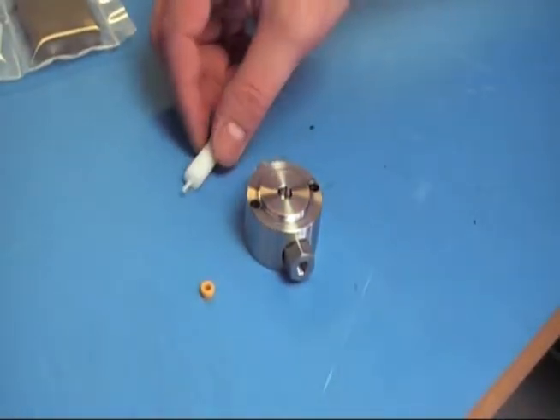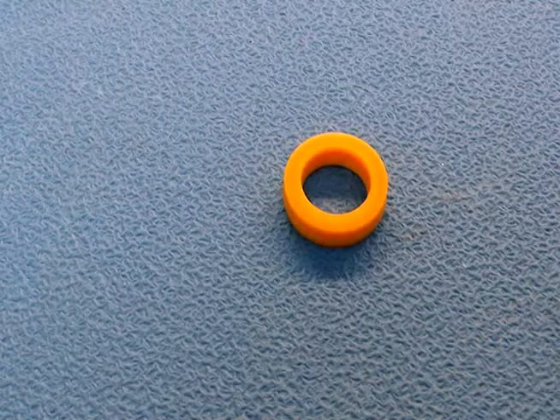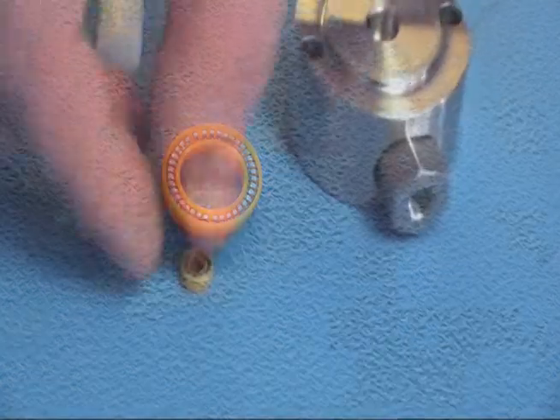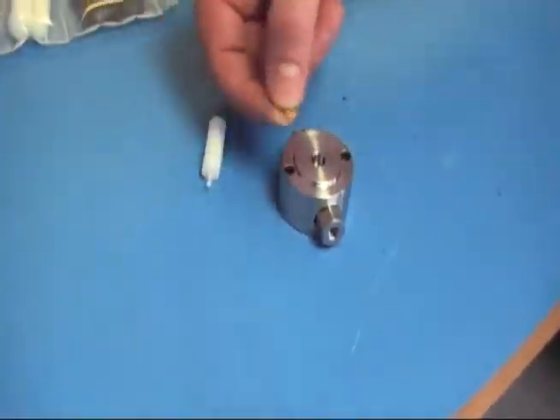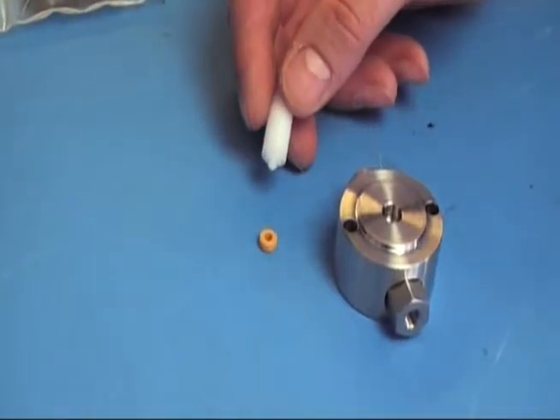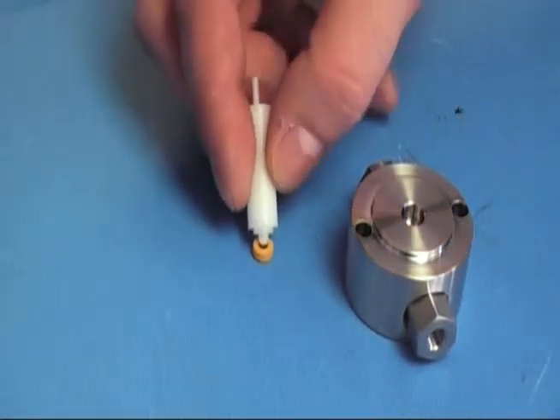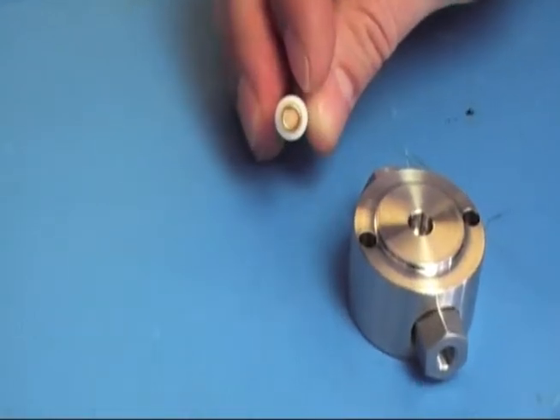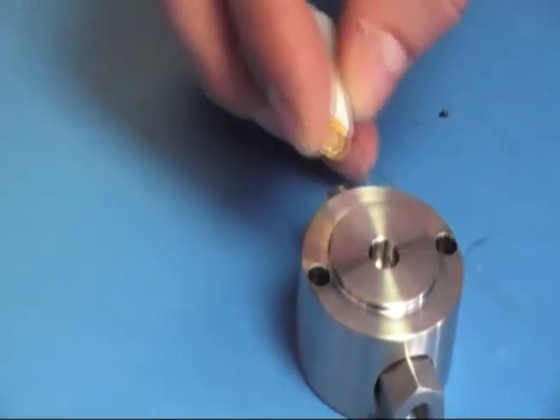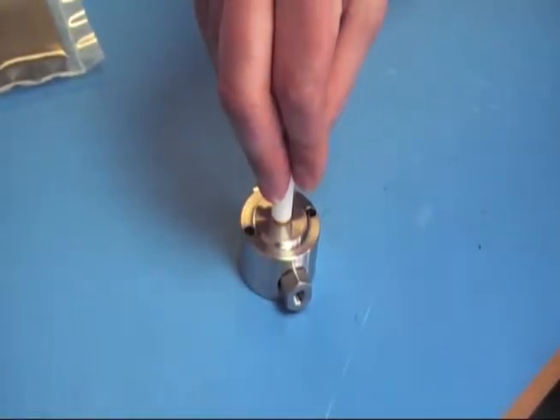Discard the old seal. Now when installing the new seal, it's important you have the right orientation. You have the solid side, and you have the side where you can see the spring. When you install the seal, you want the solid side facing you, and you want the spring down towards the head. Place the seal on the seal insert tool with the solid end facing the insert tool. Put it over the bored out hole for the seal, slide it over, and press down.